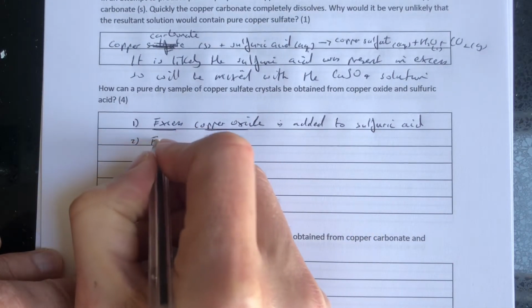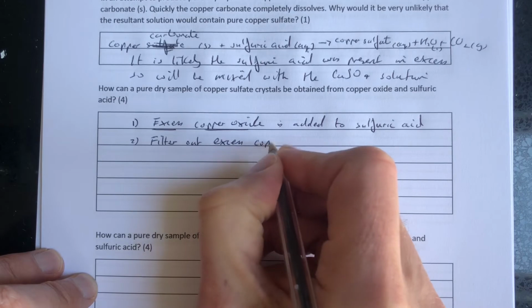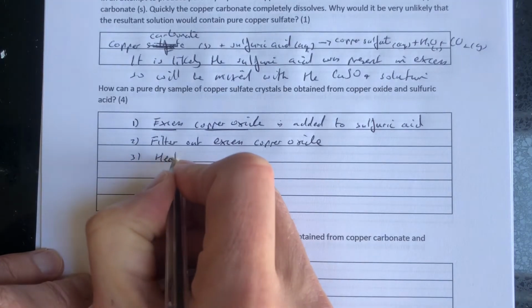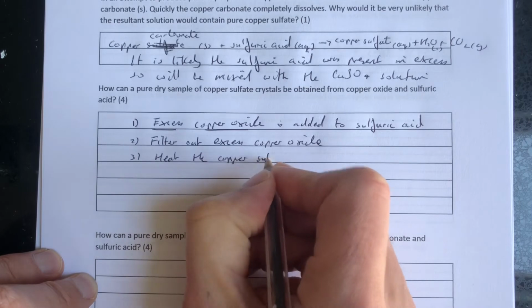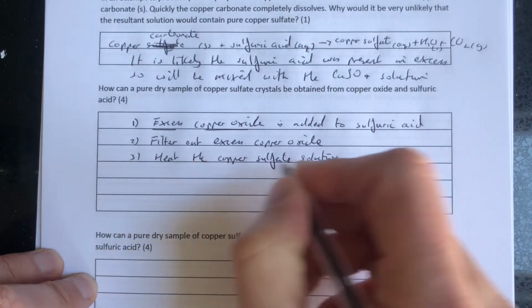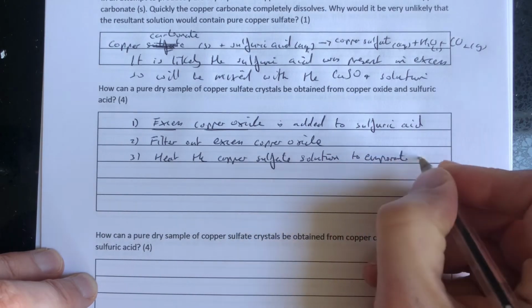2, copper oxide is insoluble, so filter out excess copper oxide. 3, heat the copper sulfate solution. So the sulfuric acid and the copper oxide makes copper sulfate and water. So we're going to heat the copper sulfate solution to evaporate the water.